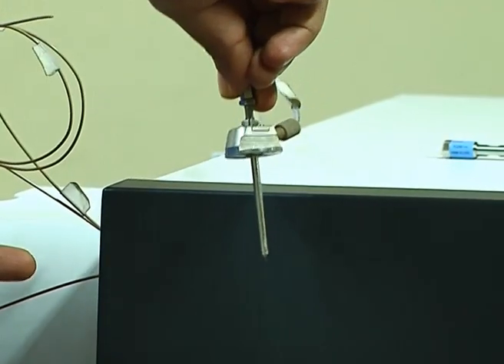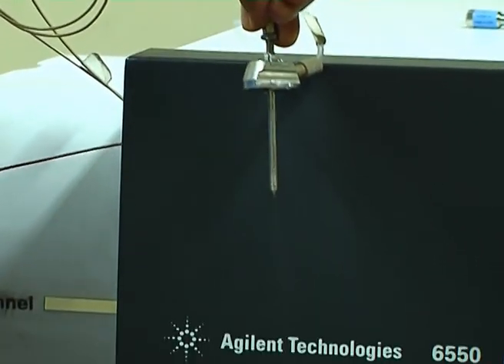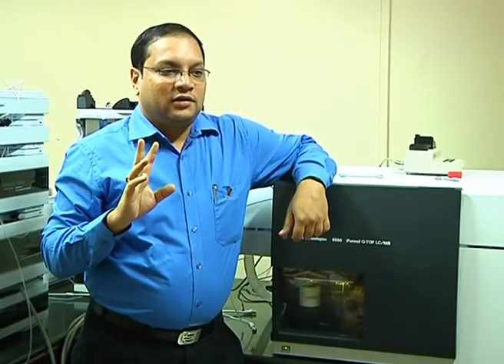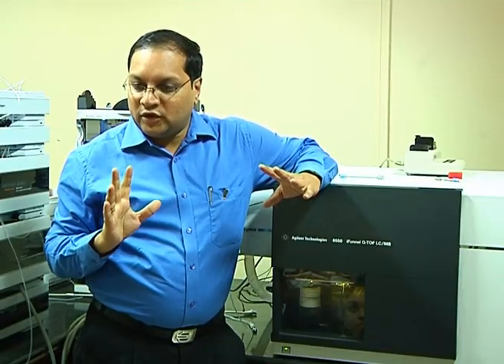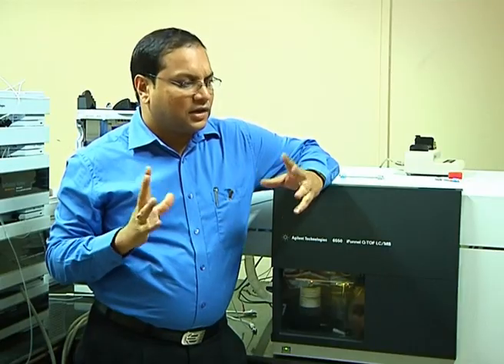You see, this is how it happens. Now one drop has become like this spray, and inside there is high temperature, 300. You can imagine how fast, unimaginable speed it has to. So there are different analyzers. Quadrupole is one type of analyzer. Analyzer of mass. Mass analyzer.